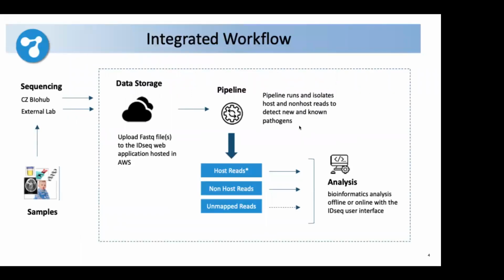And then finally, before we actually jump into the tool itself, I wanted to show this slide as a way of highlighting that IDseq is part of this larger integrated workflow. And for those of you that are more familiar with metagenomics or how work like this runs, this might look like a very familiar diagram, but I'll just run through it really quickly for those that aren't.